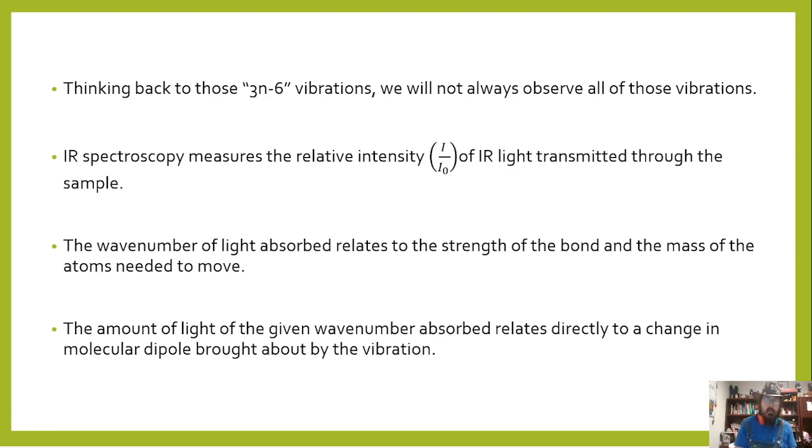So things like particularly polar bonds, if it would change the dipole, say moving it to left or right, we're going to see a very big, deep absorption. We see a lot of those for things like OHs, C double bond O's, where we see very polar bonds and very deep stretches. But here's one thing to keep in mind. Certain types of stretches, even if it's a polar bond, may result in a net non-change in dipole.